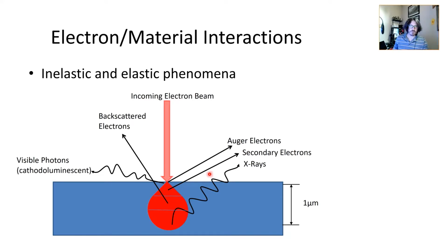We talked about the cold finger on the previous lecture on the S4800, where you can fill it up with liquid nitrogen to cool it off. And so heat is still a thing, but the signals we're interested in for this lecture are going to be backscatter electrons and secondary electrons, and we'll start taking a look at some characteristics of the imaging of these two.